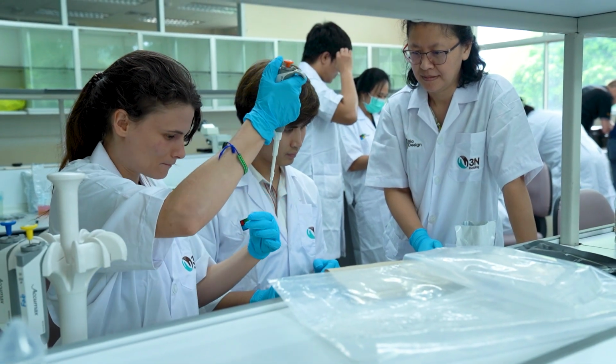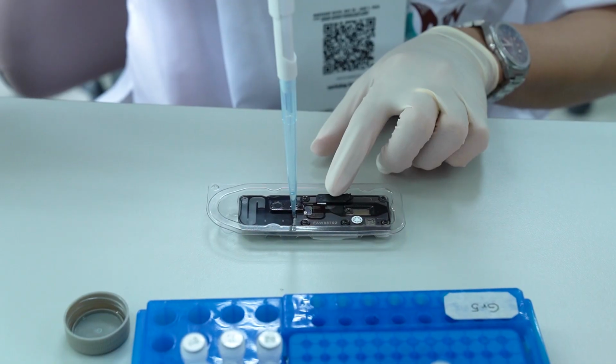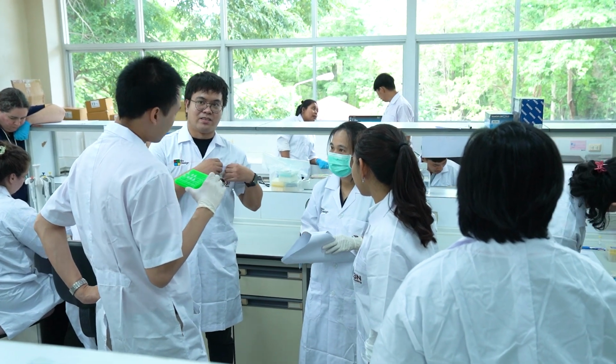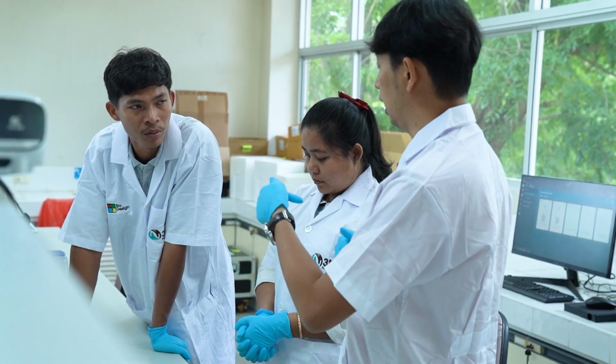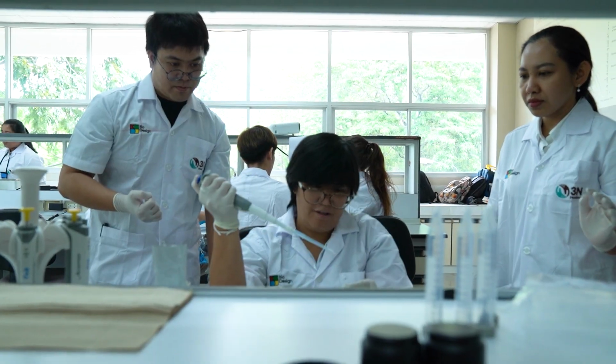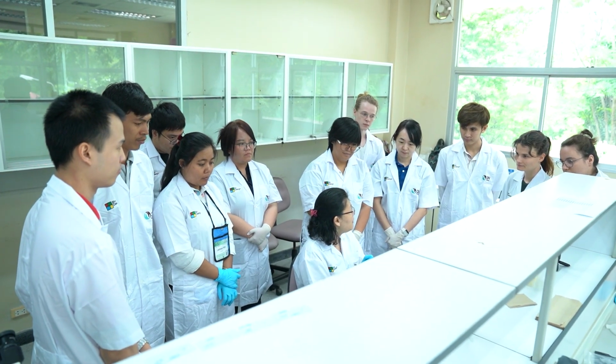We've been teaching DNA sequencing, and that's something very valuable for young scientists to learn about. In this part of Thailand, we have forest right next to this campus, and we're able to sample animals, mammals and other vertebrates, insects and ticks, and look inside these animals and vectors for pathogens, things that can cause diseases. So what we're learning here is how to detect through DNA sequencing what is inside these samples.